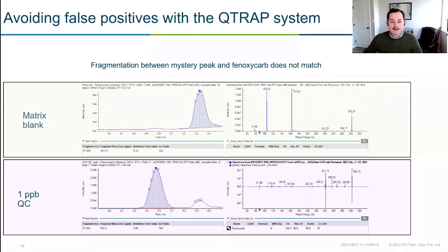I'm happy. I will go stand up, write a report, do anything. I'm 100% sure that whatever is in that matrix is not phenoxycarb. I don't know what it is exactly. I could go back and search some libraries and try to figure it out. But for the purposes of this customer, they just needed to know that it wasn't phenoxycarb.